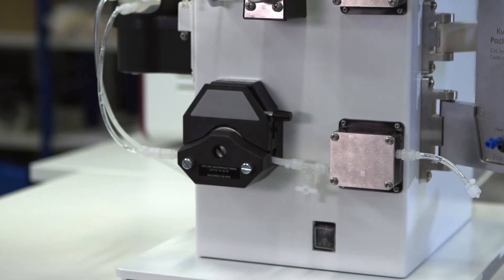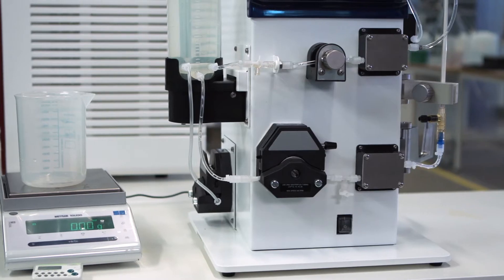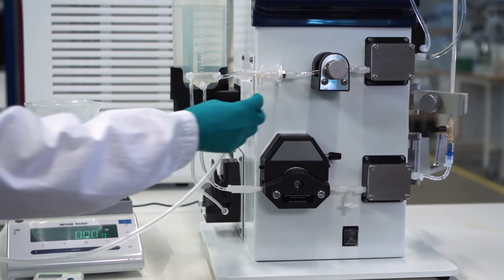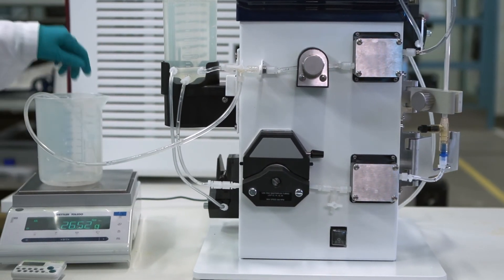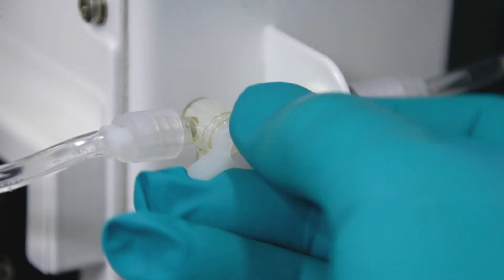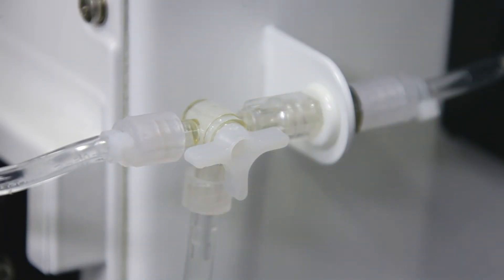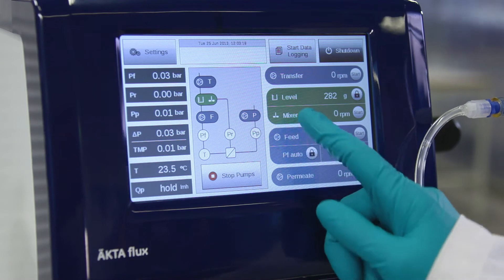To calibrate the feed pump for accurate display and control of the flow rate, place tubing in a beaker on a scale. Attach tubing to the upper drain valve outlet, open the outlet, and set the feed pump to a low speed.